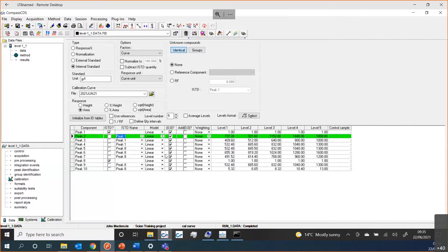Looking at some of the other features on the screen, we have different types of calibration available. We can do just straightforward area percent or response percent. We can normalize everything. When we normalize, we can also choose to normalize to some other value other than 100%. I can think of a couple of situations where that would be helpful — maybe you don't get a full recovery from the column and you want to normalize only what's actually eluted, which may be a better reflection of your results.